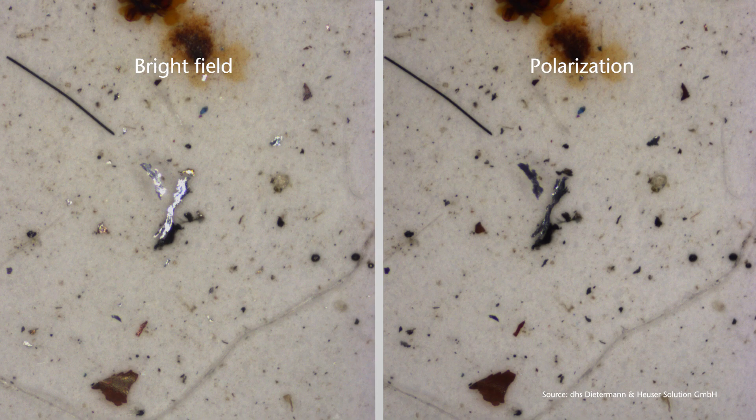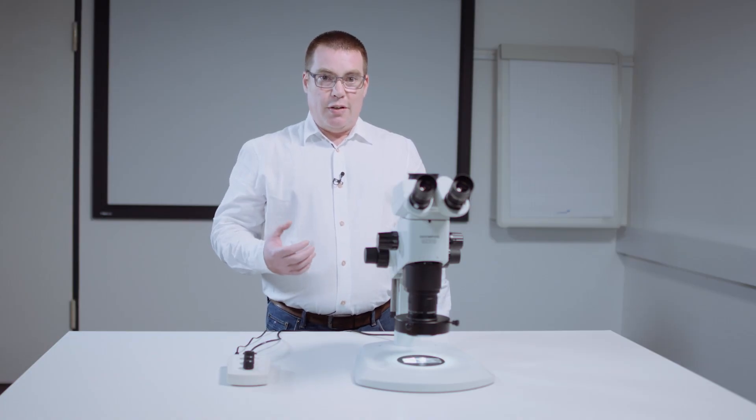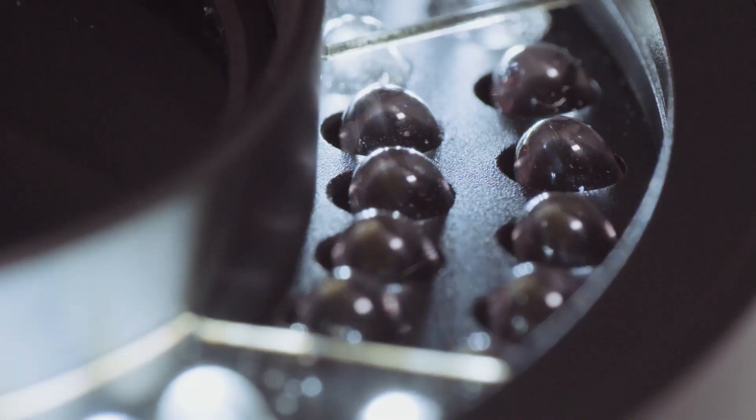Thousands of such image pairs are evaluated here. You can clearly see the enormous advantages that fast, convenient, and reproducible changes between Bright Field and Polarization offers.